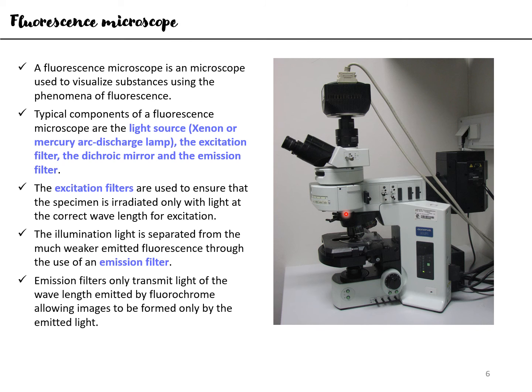But in an inverted microscope, the objective lens, which collects the image, is actually present underneath the stage, whereas in a fluorescence microscope the objective lens is placed on top of the stage, and this is one of the main critical points of difference. So although it might apparently look like an inverted microscope, it is not.